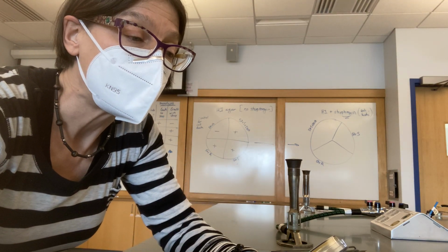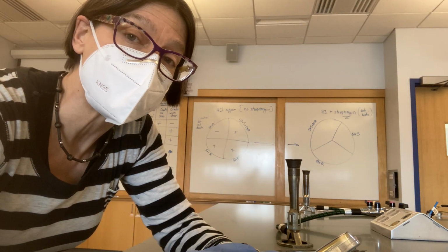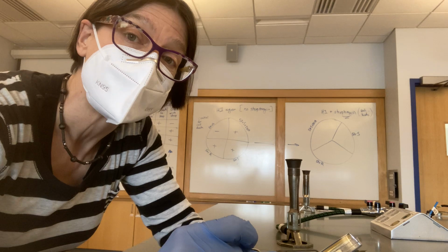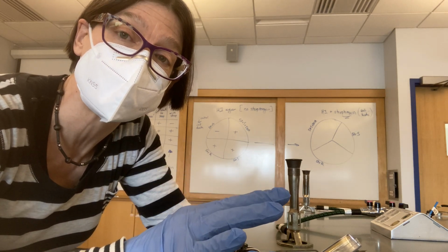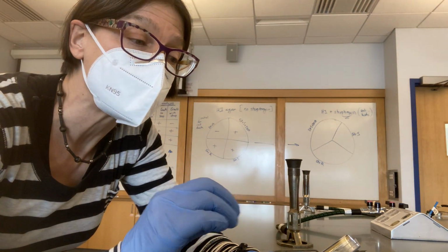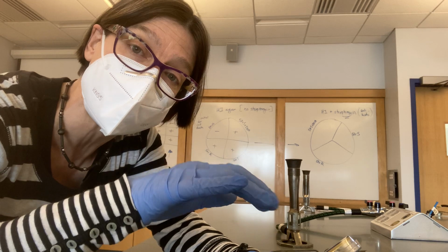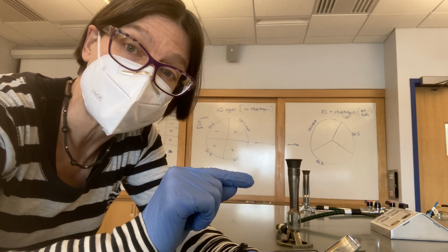So on day 1 of the lab, we worked with those 2 strains, and then we took the strain STRR and we killed it using sodium dodecyl sulfate, a detergent, and heat. That killed and lysed some of the cells, releasing DNA into a solution, which we're just referring to now as the DNA solution. Those cells which were STRR that we killed, they contained the AAD2 gene. So some of that DNA released out into solution was AAD2 DNA.